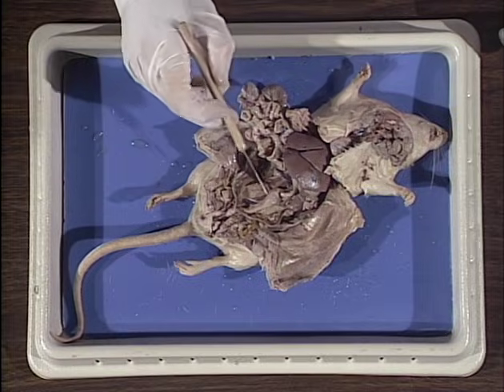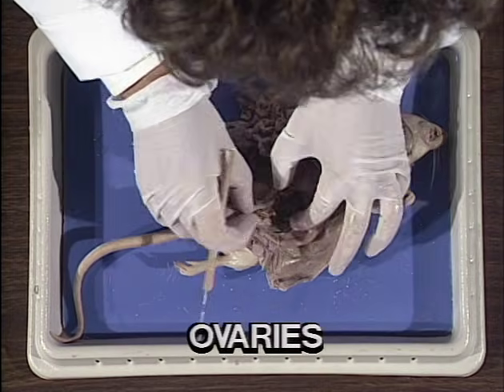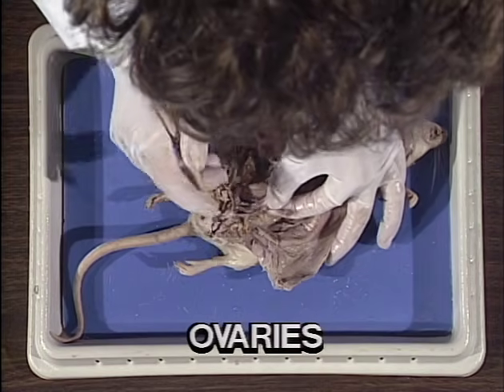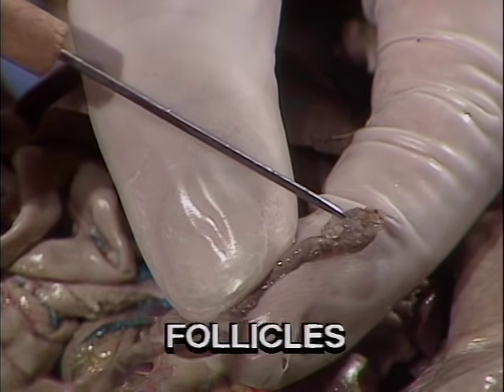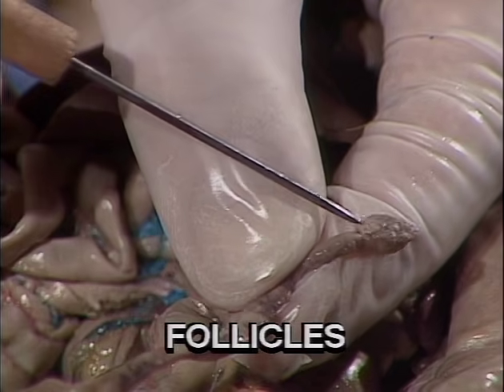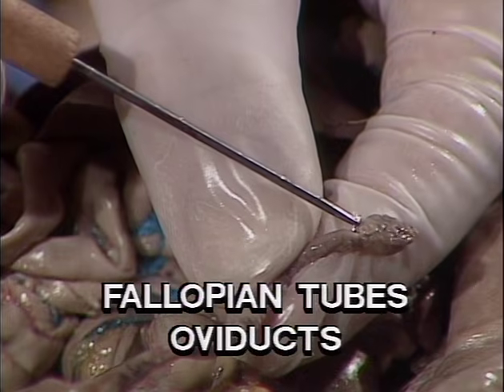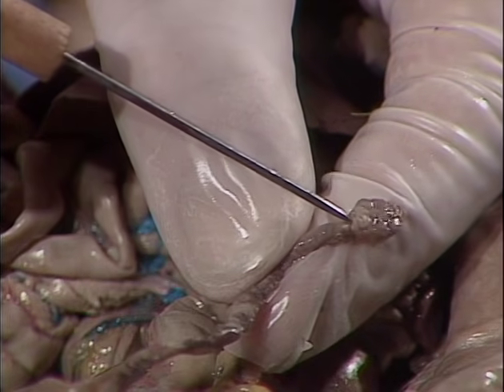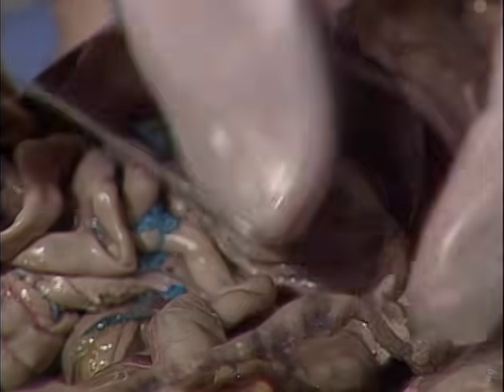In the fatty material just below the kidney are the ovaries. They are small, round structures containing many follicles. Adjacent to the ovary are the fallopian tubes or oviducts. Inside the oviducts are little cilia which beat to draw the egg from the ovary into the uterus.